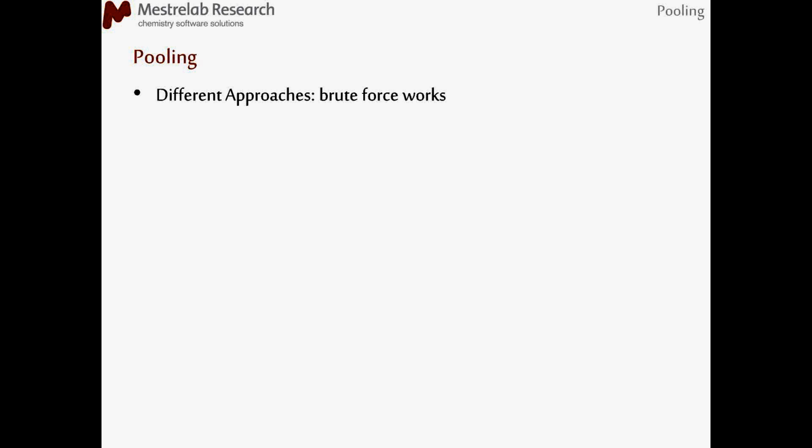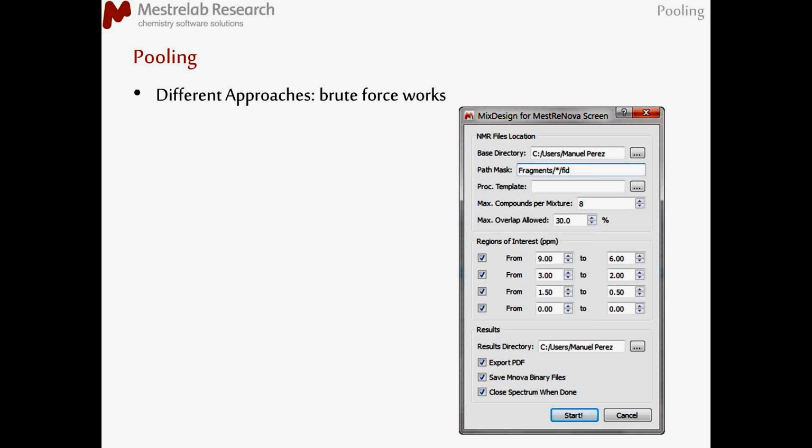We personally have experimented with quite a few of them, and to be absolutely honest, this is one of the cases where brute force works, and it works very well. In the case of the creation of mixtures, we have designed a tool in which, very briefly, we are looking at all your original spectra for each one of the individual fragments.